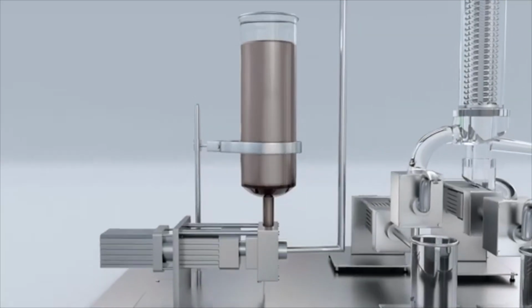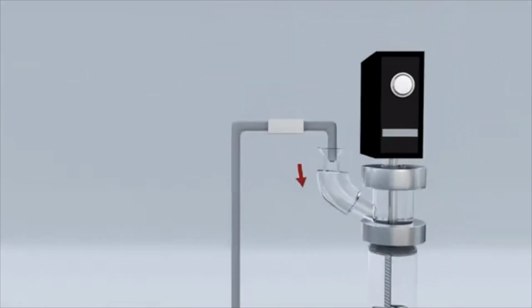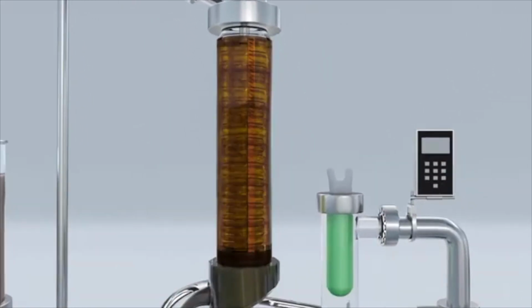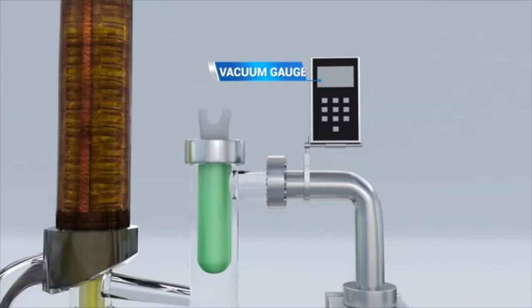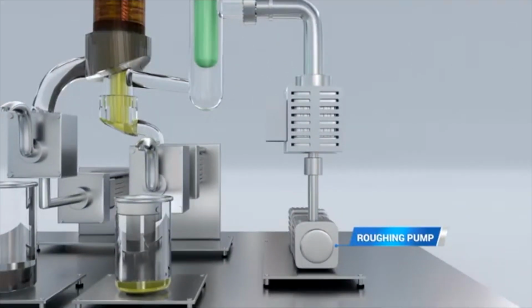What do you use to aid in dropping that pressure? Vacuum pump. The evaporation of compounds happens at different rates depending on the vapor pressure of each constituent. Compounds with the highest vapor pressure tend to evaporate from the solution first as heat is applied during distillation. Compounds evaporate from the solution in order based on their atmospheric boiling point as heat is applied.